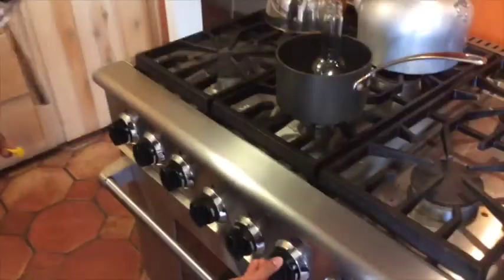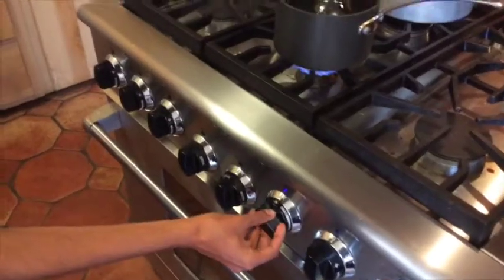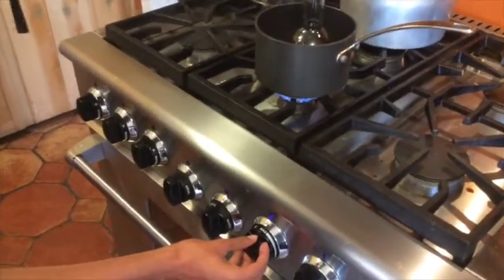Which one? This one? Where should I put it to? You turn to the right. About how much? That's fine. Yeah, that's probably good. Okay.